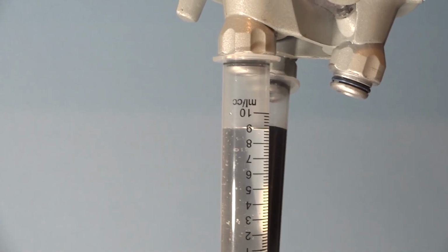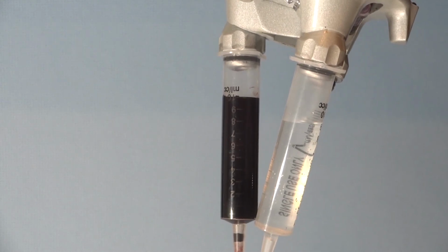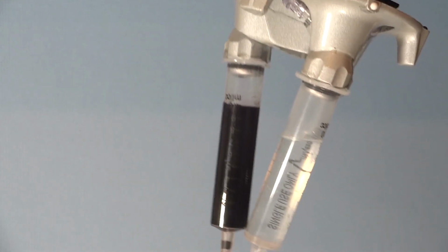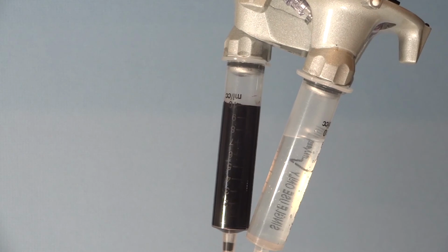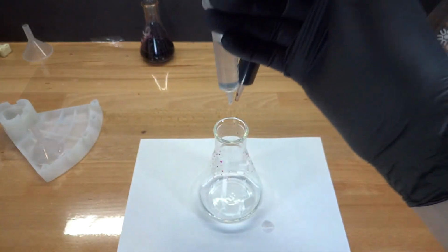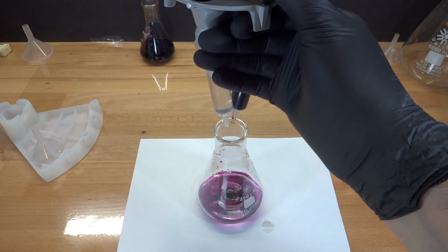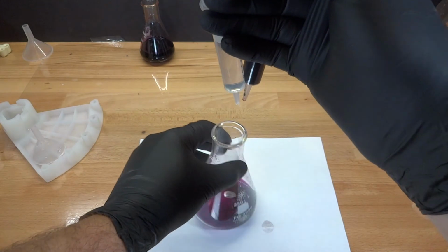Before proceeding with the first titration, please record the initial fluid volumes. We will focus on increasing the proportion of the titrant in an acidic solution dominated by the analyte. We will be dispensing the titrant B and analyte A simultaneously, setting our pipettor to produce a ratio of 1/4 B to 3/4 A.